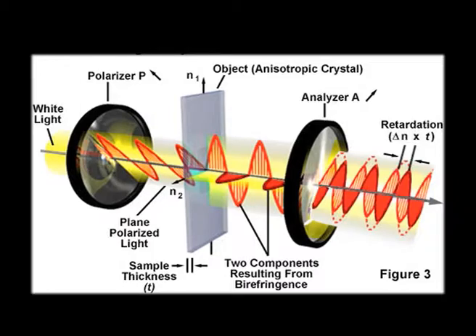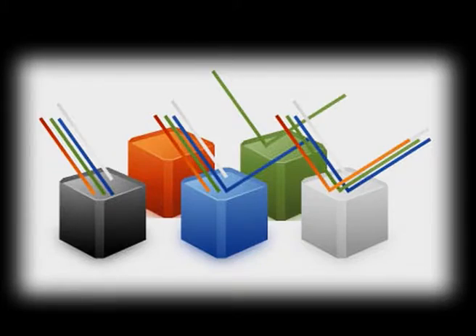Now, how do we do that? This is mainly by giving light in a defined optical axis. If there is anisotropy present, then it will get deviated from that optical axis. Now, light, if it has a proper wavelength and proper energy content, can also be absorbed by the interacting substances.